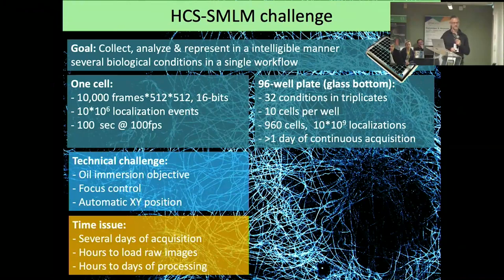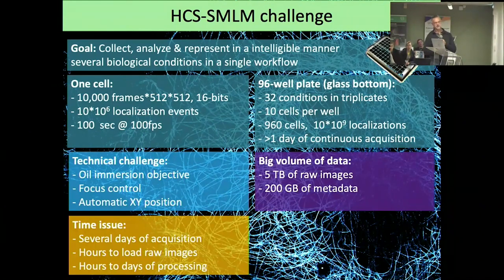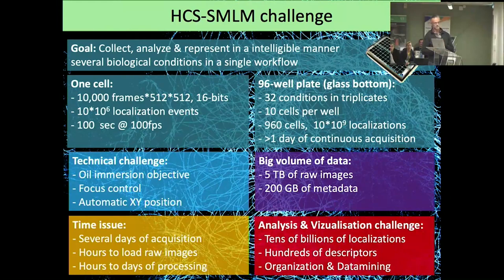It's the time, of course, not only for the acquisition, but also for the raw data, which I didn't say. The raw data come here: terabytes of raw data images. So if you collect terabytes of data and then you wait, it will take a week just to load and analyze them. And then from that, you extract gigabytes of metadata, which is much smaller, but then you need to use them for the analysis. And of course, you need to represent that. Visualization, analysis, classification, this is what you want. You have hundreds of descriptors.